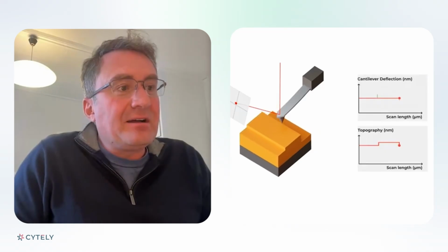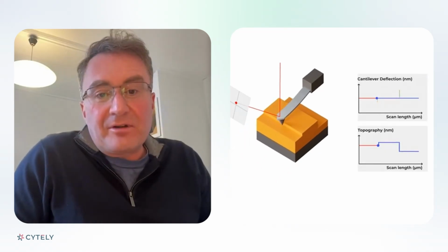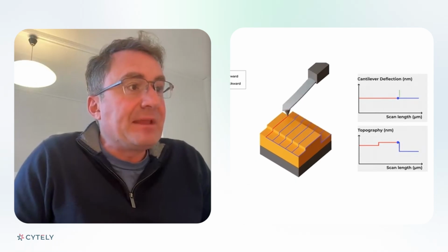And to learn about physical interactions, of course, one has to be quantitative. So once we want to be quantitative, looking at biological data, we need to work with large numbers of viruses and cells. If you work with single particle experiments, and by single particle, we've been working with single viruses in our analysis. We've been working with single cells in our analysis, and different types of measurements, like trapping cells in microfluidic chambers, using atomic force microscopy to look at single viral particles on a single cell nucleus, for instance.